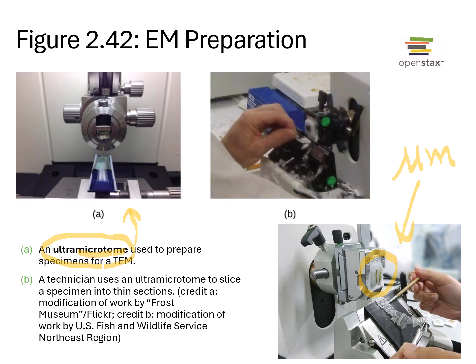An ultramicrotome, as the one shown here, is very similar, except it's what it sounds like. You're making extremely thin slices of your sample in preparation for electron microscopy. So instead of being as thick as what we produced over here, the thickness of these samples is going to be on the order of nanometers, so 1,000 times thinner than what we produced earlier.